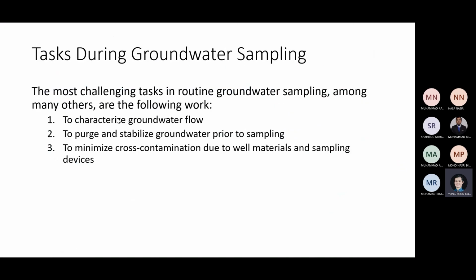But there's one more thing that you have to remember. Every time we need to sample groundwater, we need to make sure that contamination is at its lowest level. Now, why? When a tube well is shut down, bacteria is there, definitely. And usually inside the tube well, there is no flow. It's not like a river. It sits there.